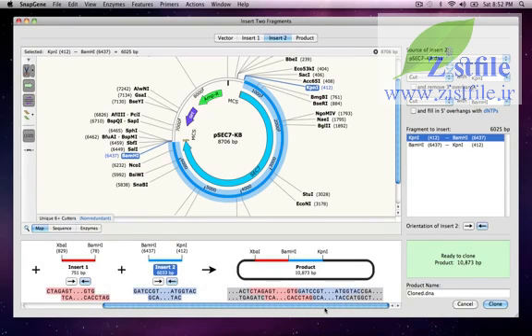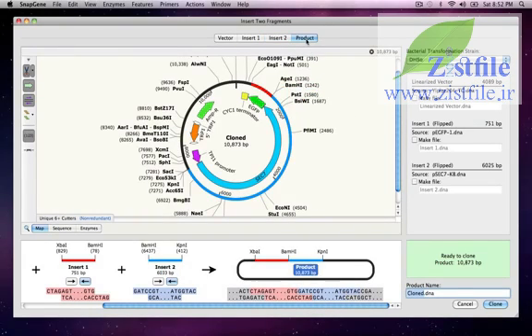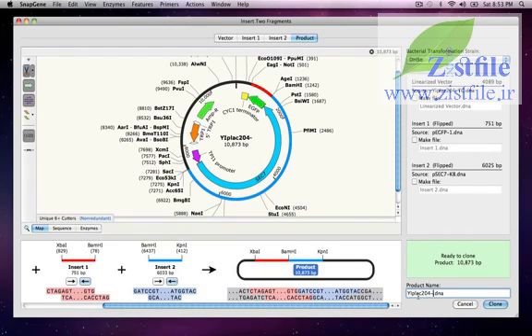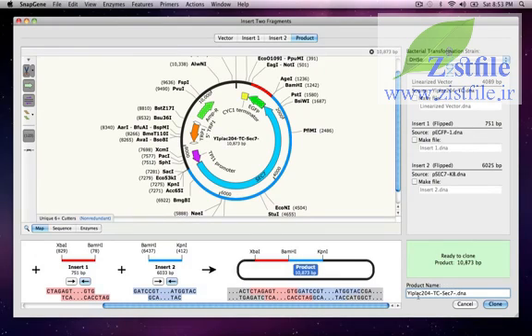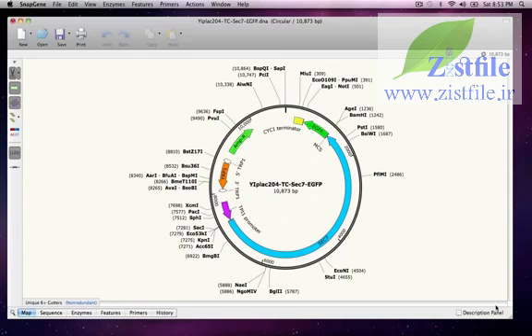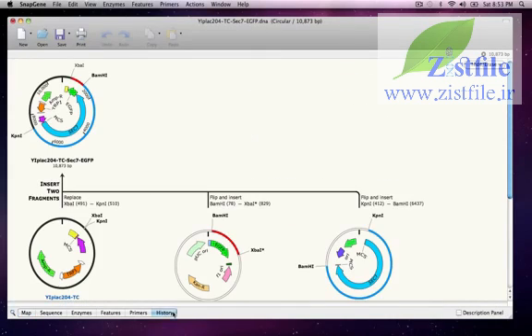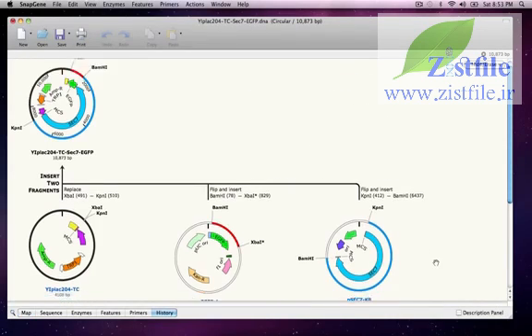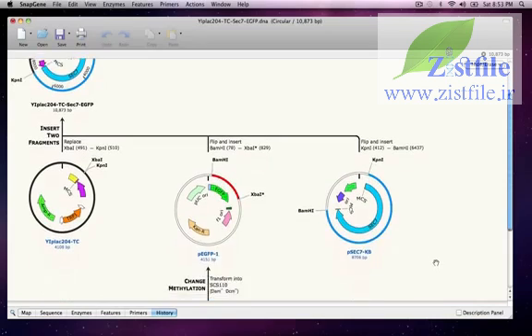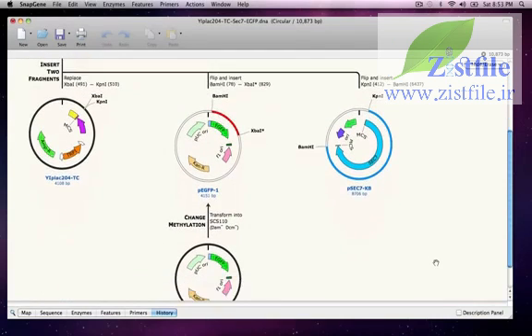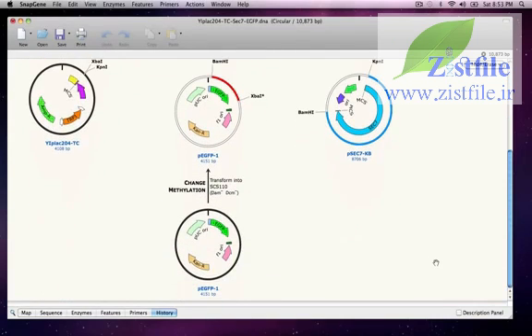I can preview the cloned product in the Product tab. I'll click here to give it a name, YIPLAC204TCSEC7EGFP. When I press Clone, my final product appears. Again, I can click on the History tab to see the steps in the procedure, including changing the methylation of P-EGFP1.